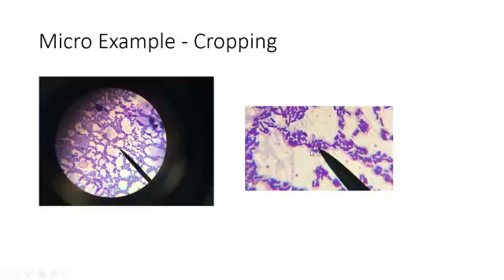See, we've got some bacteria here, and we've got a little bit of stain around it, and this is a wonderful example of a capsule stain. So by taking this picture and cropping it, you can see what I was looking at. We're going from what my camera saw to what my eyes saw. So now let me show you how to do this.